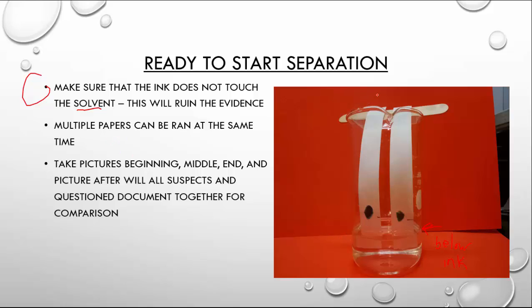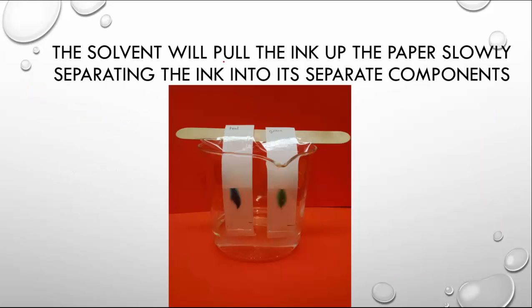Multiple papers can be run at the same time. We want you to take pictures at the beginning, middle, and end to see what's happening as the solvent starts to travel up so we can have some comparison. What's going to happen is the solvent will be pulled up the paper, and as it's pulled up it's going to push or pull the ink along with it, and as it does it's going to begin to separate the ink out into different colors. You can see the solvent line here, and that solvent line is going to keep moving up, separating our ink out into different components — basically different colors.